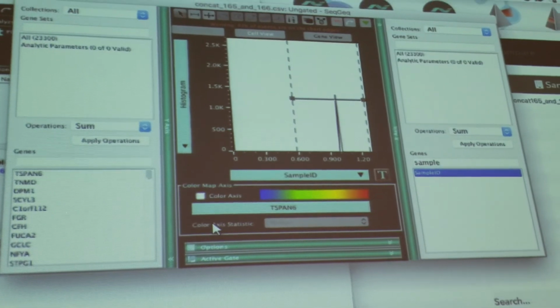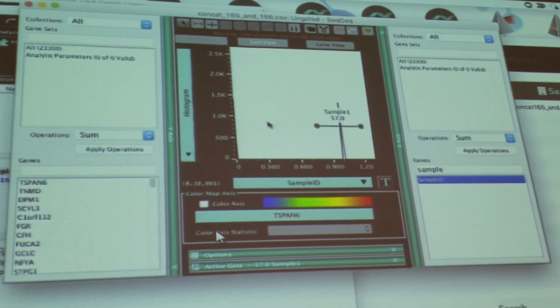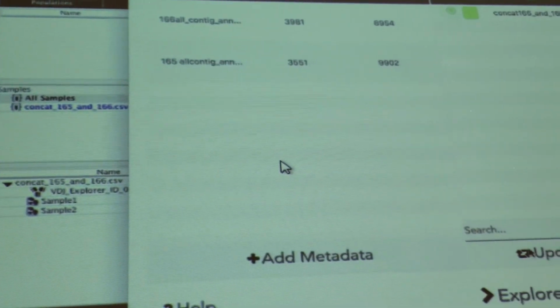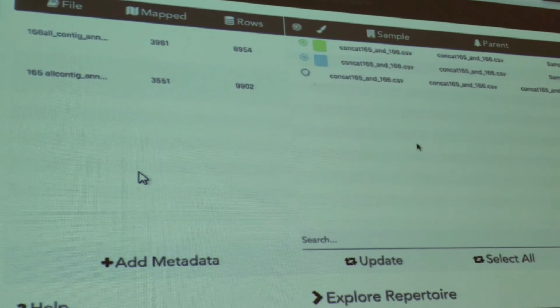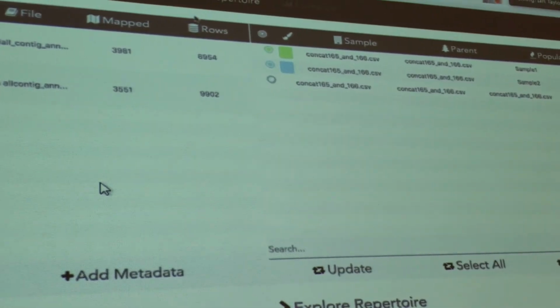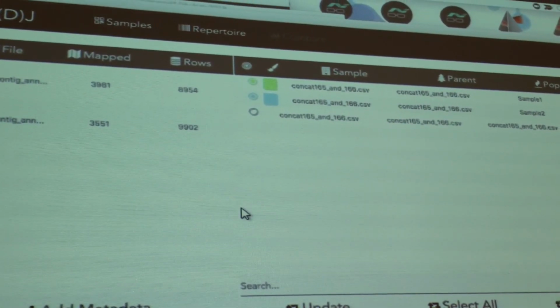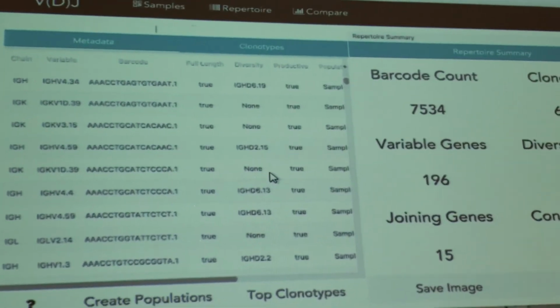That didn't work. And I think ideally we'll be able to refresh that, but with regard to those, I really like making this with those unbiased clusters. Plus, then you have a diverse range of populations. Once you do get this mirrored, clicking Explore Repertoire will take us into this new kind of display for the data, and it gives this summary.